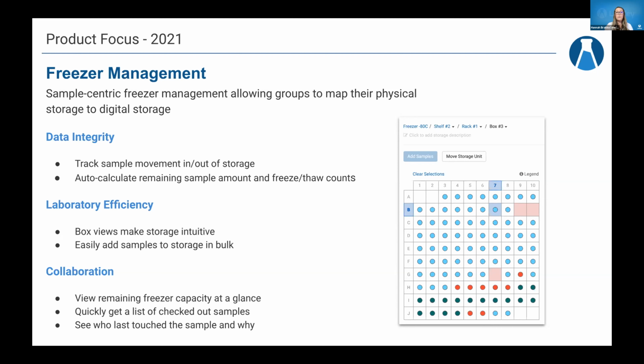Being able to view that remaining freezer capacity at a glance. And so that's something that we're displaying on every screen. We've gotten a lot of feedback on this, and we want to continue to improve on that as well to allow folks to be able to utilize that even more.